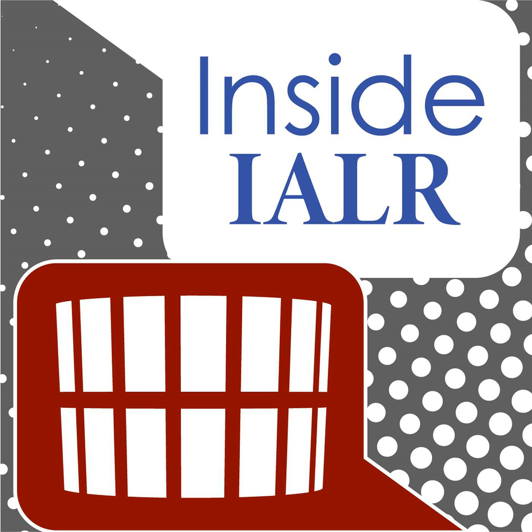Right. You mentioned interns. Tell me kind of about the work that interns have done. I mean, you bring in interns every summer to kind of tweak and improve and work on these things. So tell me about some of the enhancements, the improvements that interns have worked on these platforms over the summers. I wish I could take a lot of credit for developing the software side and even the control side, but almost all of that credit should go to interns and other students we've had working on those tables.